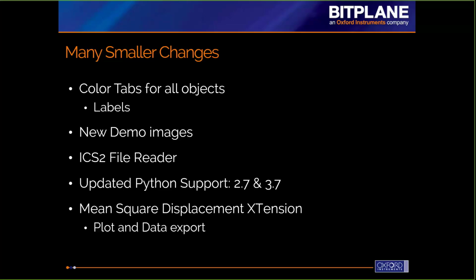We've included new demo images, and that's great for us because we're able to show off more of how Imaris works. We've included analyzed objects within there, so analyzed images with surfaces and spots. And I'm mentioning it here because I expect that there are some core facility managers and directors on the call, and I think these will help you when you have those first-time users that want to just play around a little bit, and you'll be able to give them some images that have already been analyzed so they can see what's what and get a better understanding of how Imaris works.